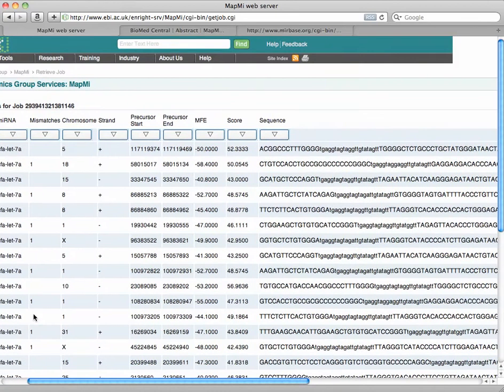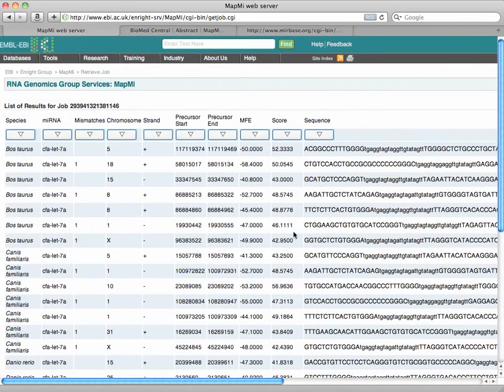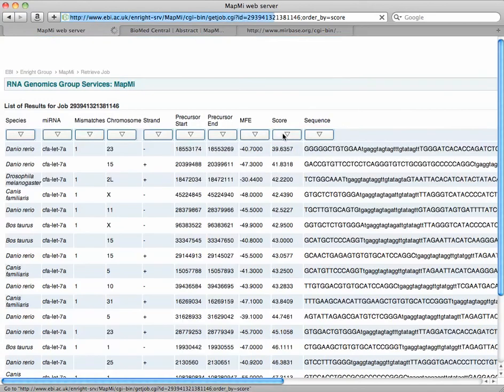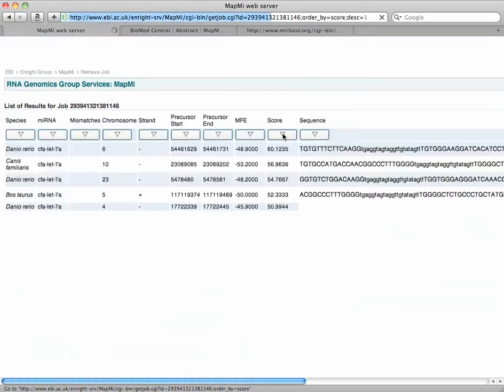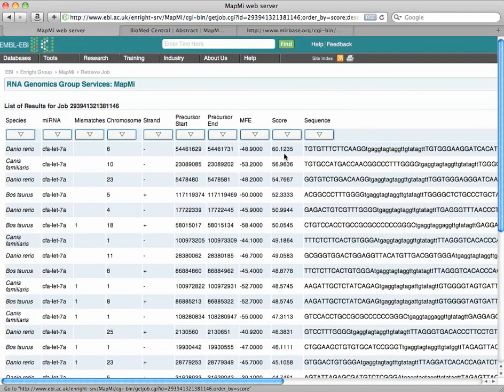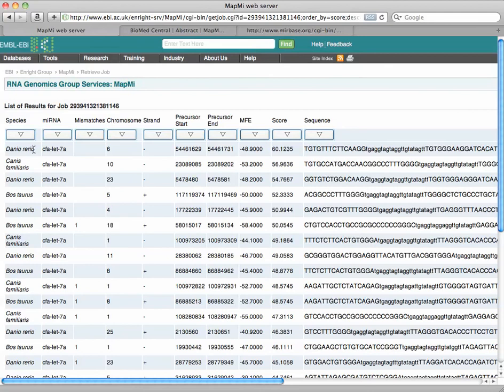So now you can explore these a little bit. You can order them by the sequence. You can order them by score. Let's do that. There you go. Highest score is zebrafish here.